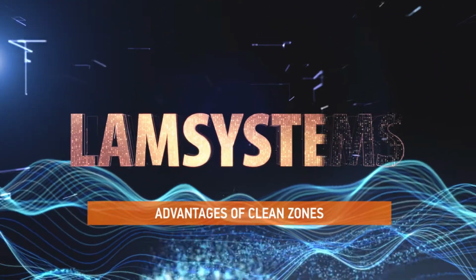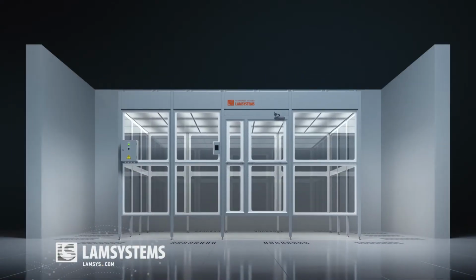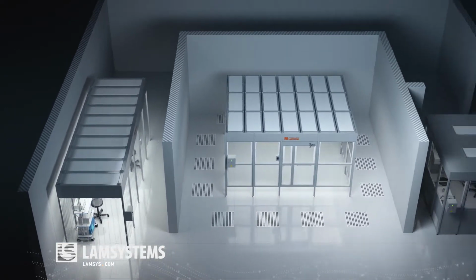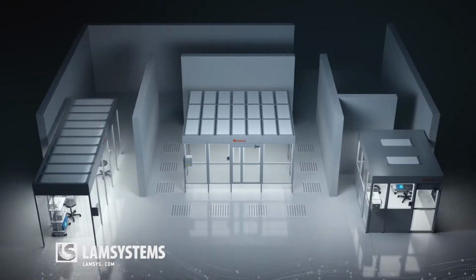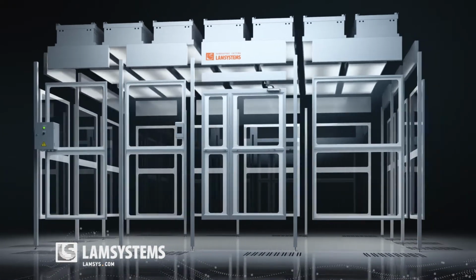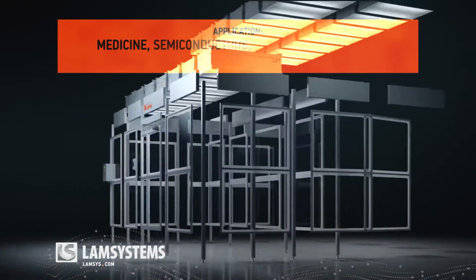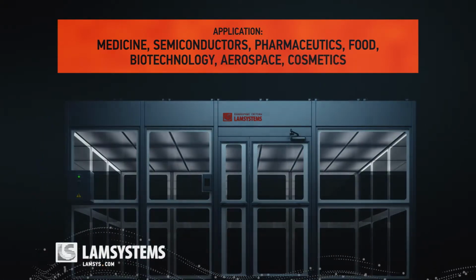The clean zones have the following advantages. Can be used in a clean as well as in a regular room. Clean zones are compact, therefore they can be used almost in any room. Clean zones ensure the same level of cleanliness as the clean rooms, but are significantly more cost-efficient. Clean zones are mobile and can be used where it is required at the moment, as modular structures that can be assembled and disassembled. Clean zones are used in all industrial fields that have high requirements to air cleanliness.